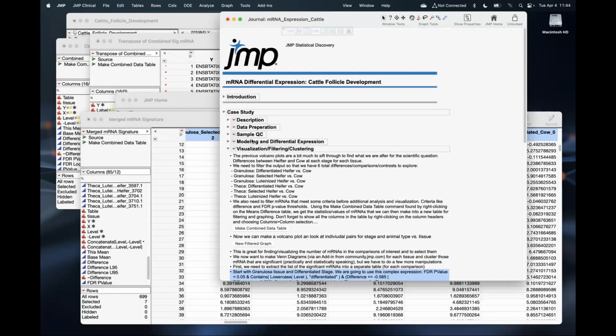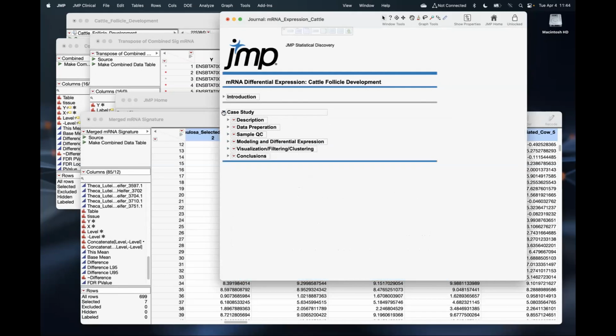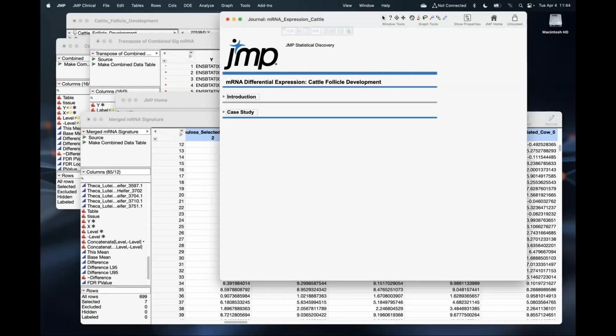I'm going to stop here for a second. What questions do we have, or maybe unanswered, Ross? Hey, Chris. Yeah, I think we have a couple that'd be good for you to comment on briefly. First off, a pretty high level one. Are all of the genomics tools in JMP only for gene expression, or can they also be used for population genetic or genomic data?